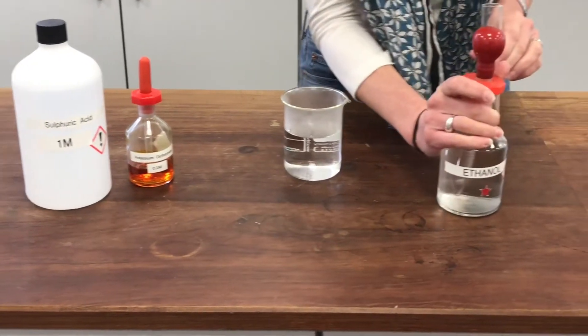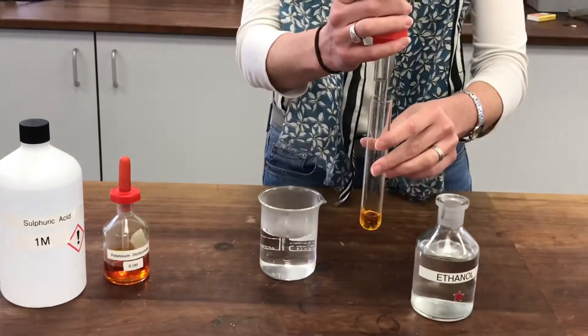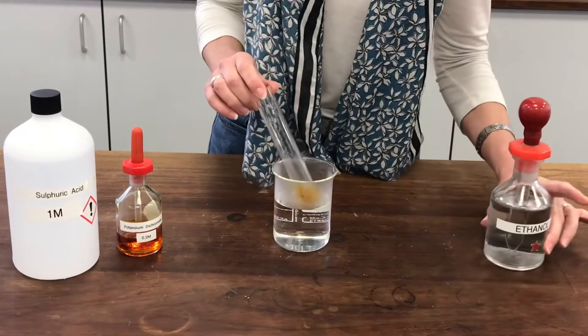I'm going to add some ethanol to it now. And then rather than heating it directly in a Bunsen flame, because it doesn't respond terribly well to that, I'm going to stand it in this beaker of hot water so it's like a water bath.